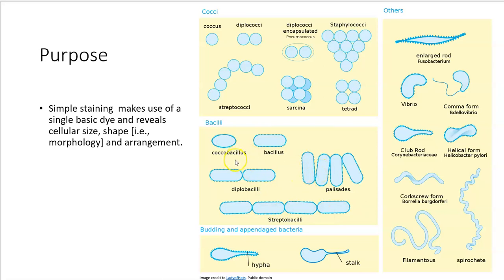There are strains, or species, that form coccobacillus, which is kind of a hybrid between cocci and bacillus. So we tend to refer to that as just a very short rod. That's common for something like E. coli. There are also some more rare shapes over here. So for example, Vibrios are curved rods. We have spirochetes, which have this spiral type appearance. But definitely in this course, what you're going to become most familiar with are the cocci, the circular bacteria, and the bacilli, which are the rod bacteria.